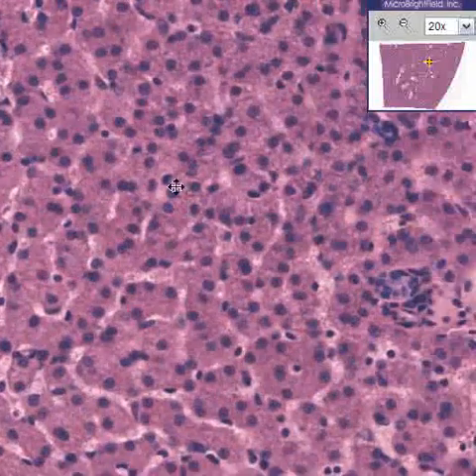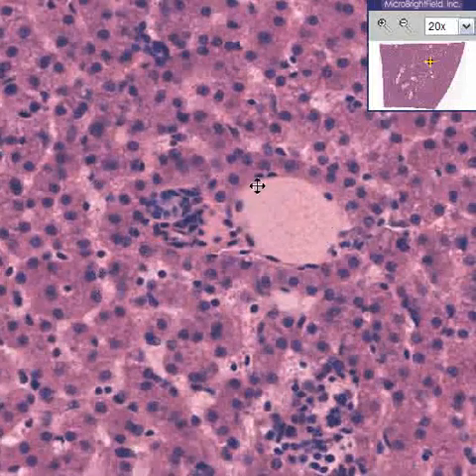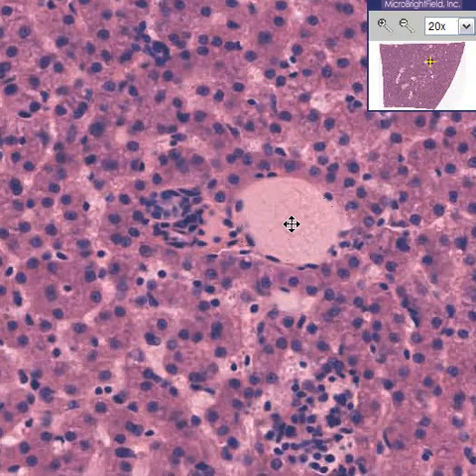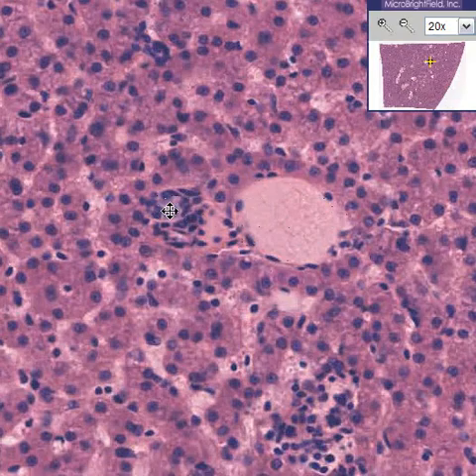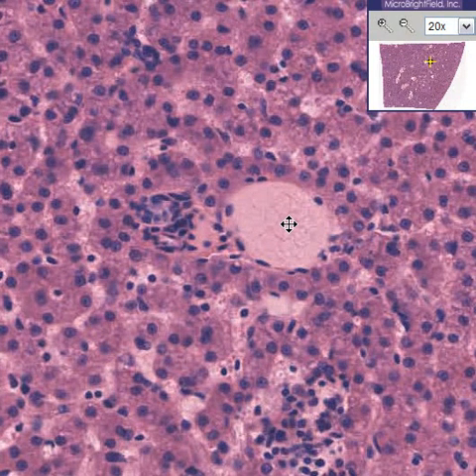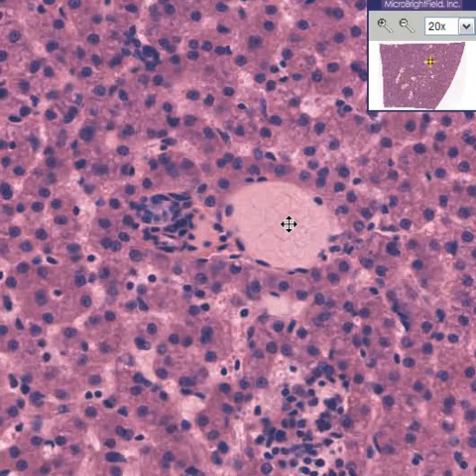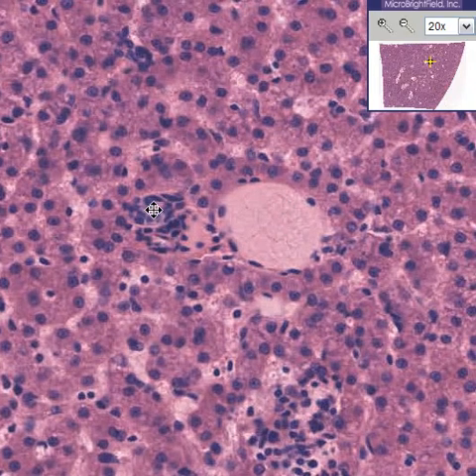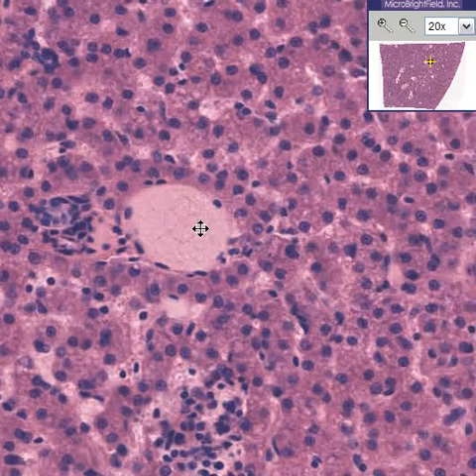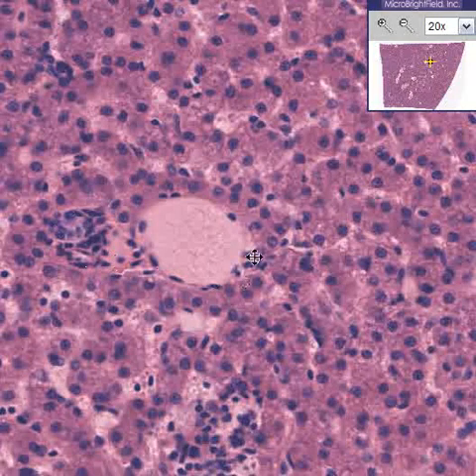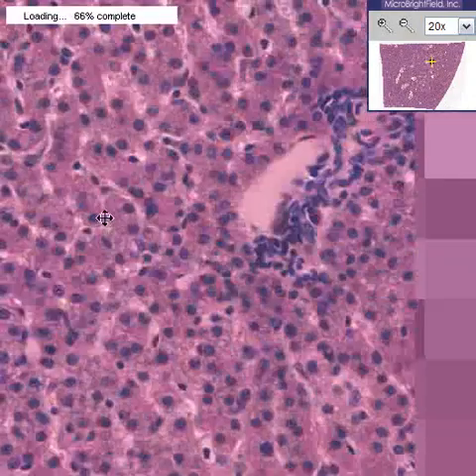Cruising on through the liver, we see a big lumen thin-wall structure which is the portal vein, a big vein, a bile duct, and probably the structure at the bottom is part of the hepatic artery. Don't be depressed if you only see one or two of the three things you're supposed to see in the portal triad, because in the real world you never see all three — you're more likely to see a couple of bile ducts and no artery, but you almost always see the vein. Remember, there's always a little bit of connective tissue at least in the portal area or portal triad.